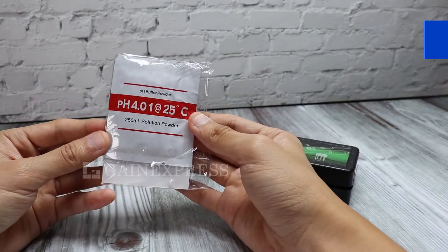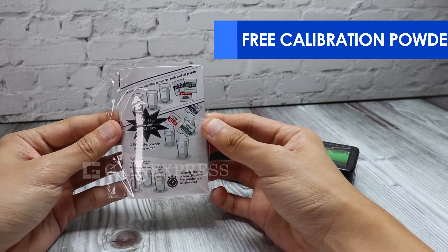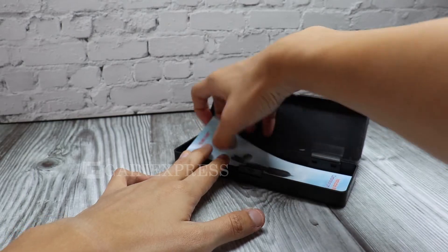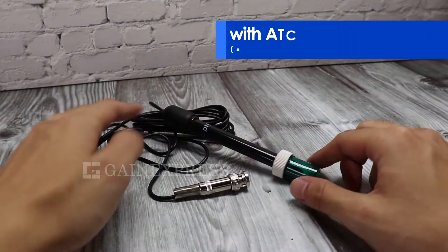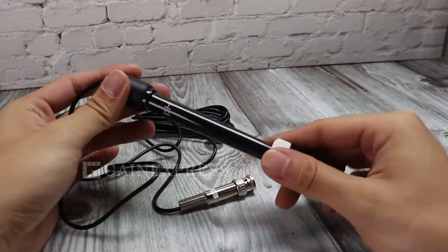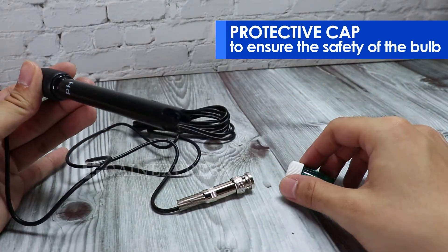It comes with free buffer solutions and an instruction manual. This PH electrode has automatic temperature compensation and has a protective cap to ensure the safety of the bulb.